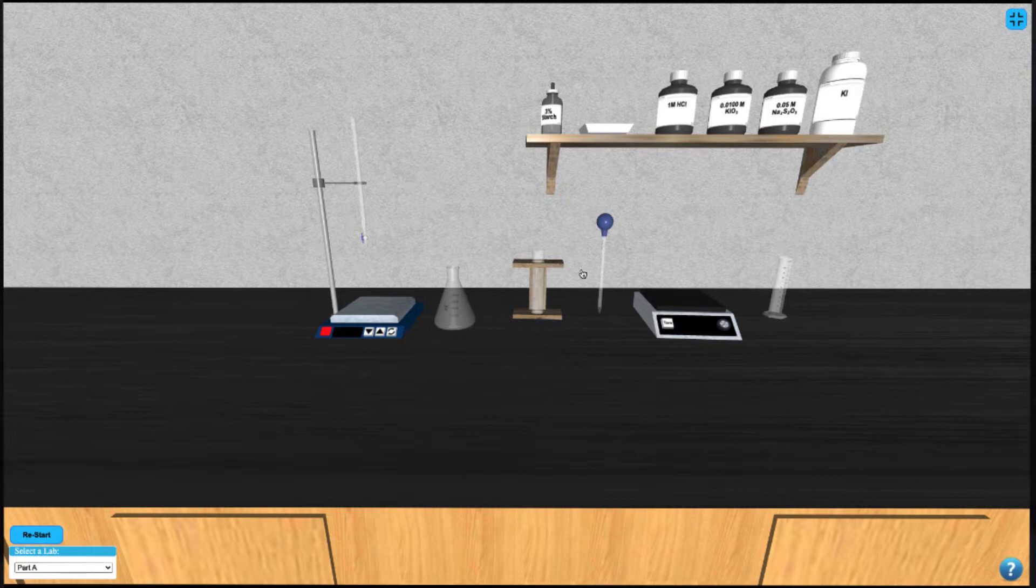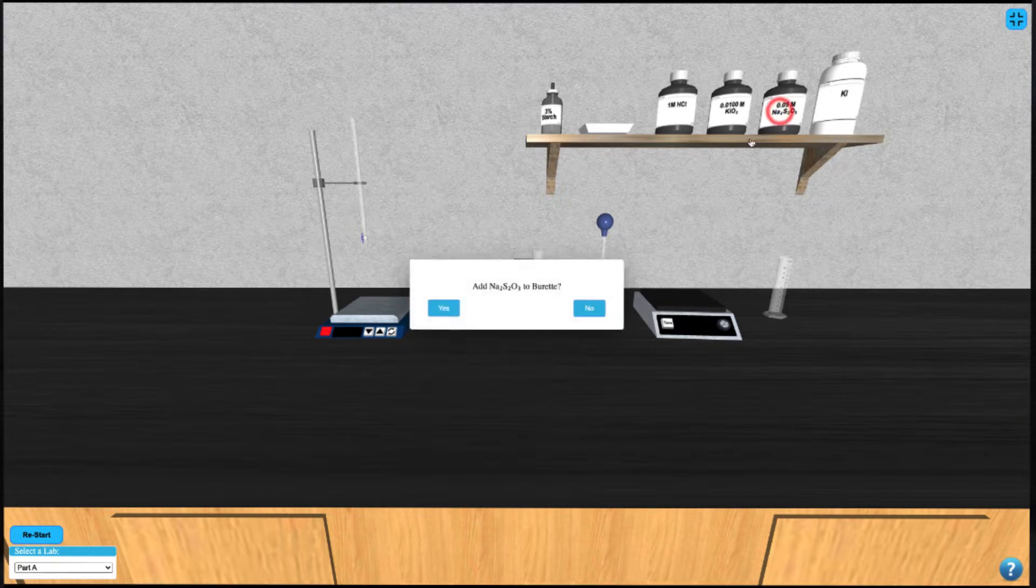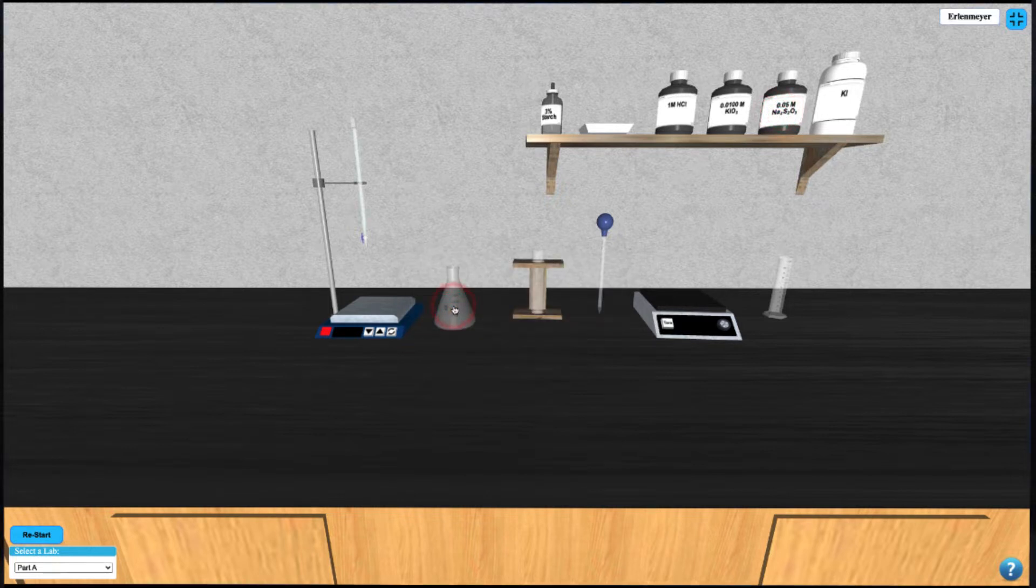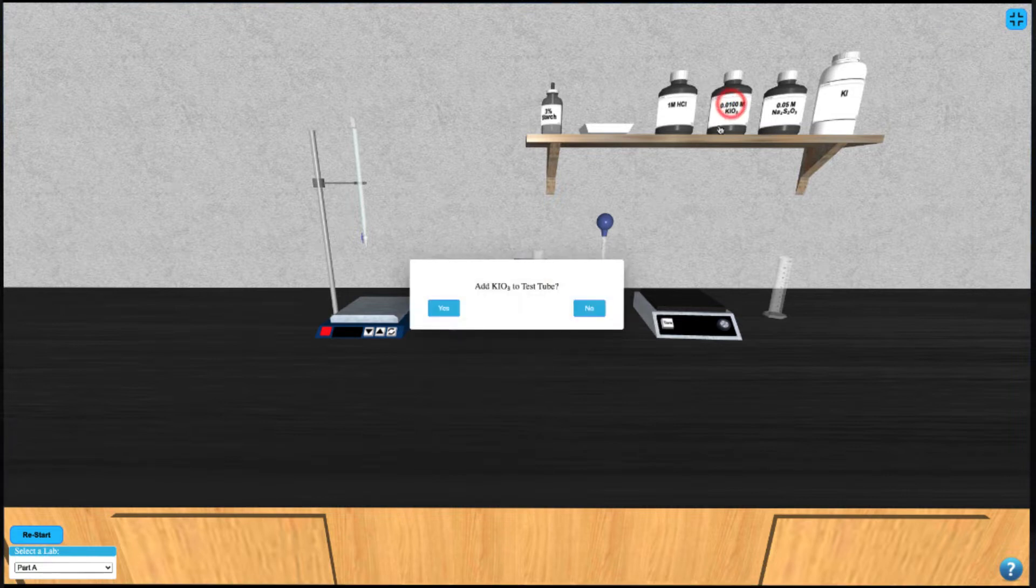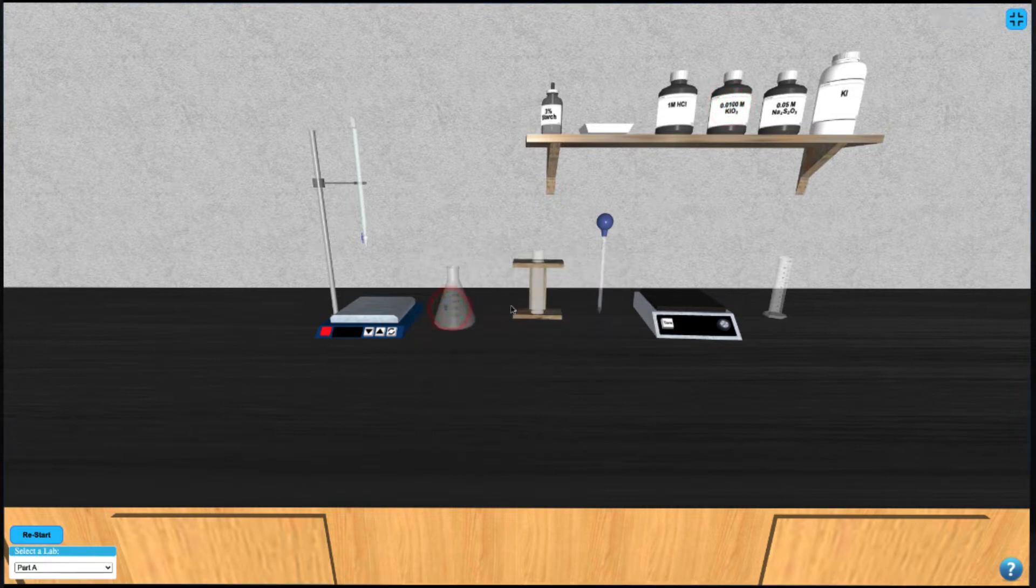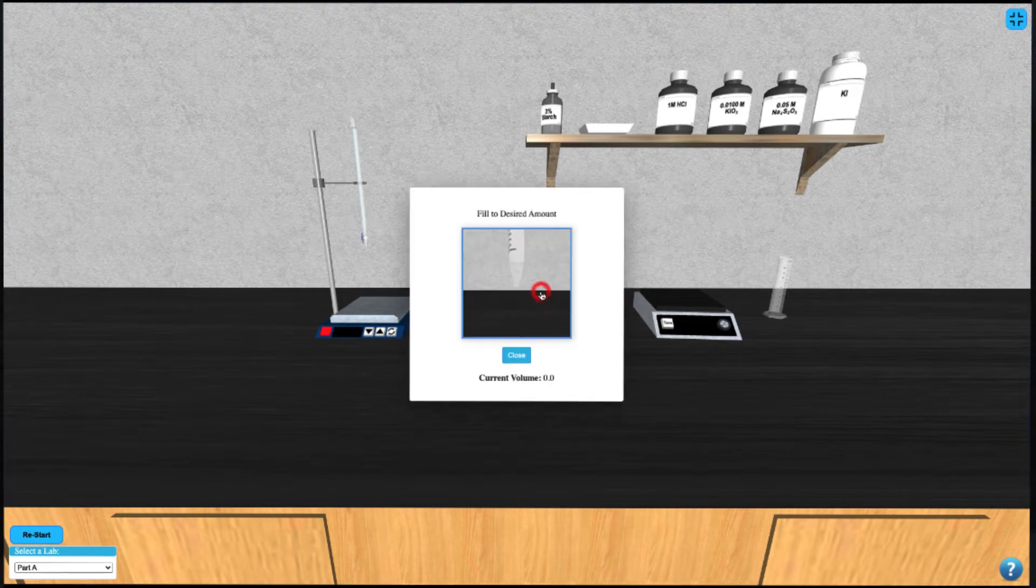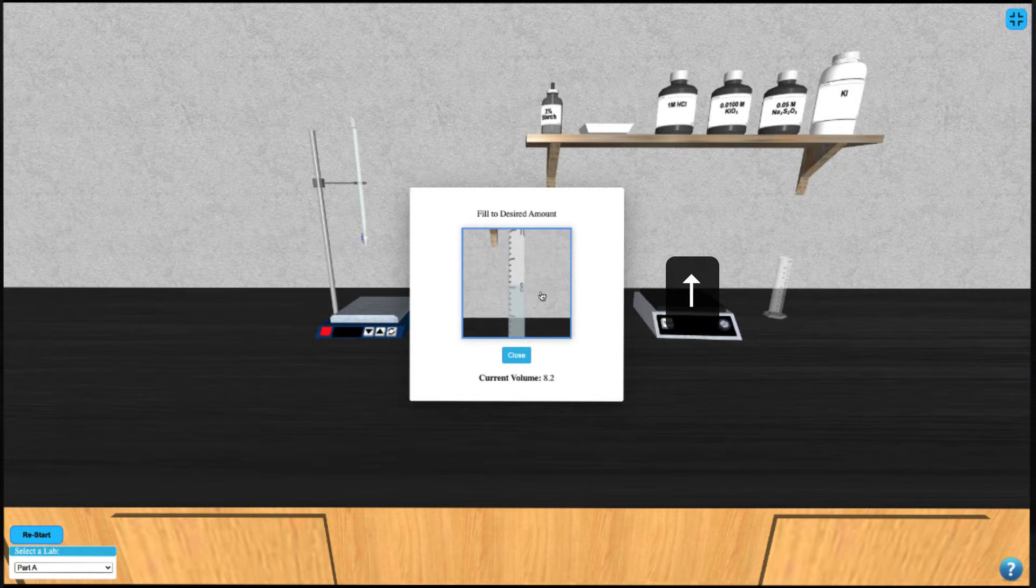We start by filling the burette with the 0.05 molar sodium thiosulfate by clicking on it. Then we add our reagent, in this case potassium iodate, to the test tube and click on the test tube to pipette exactly 10 mL of the solution into the Erlenmeyer flask by using our up arrow key.